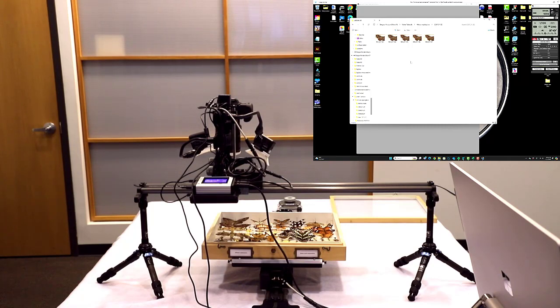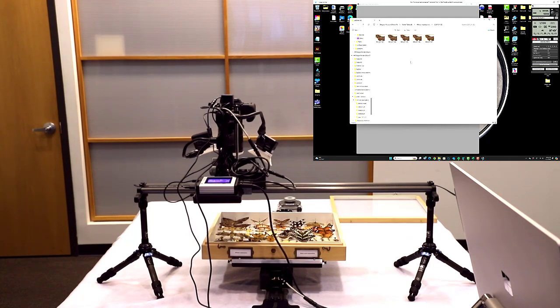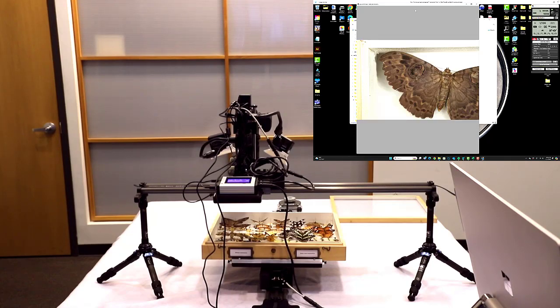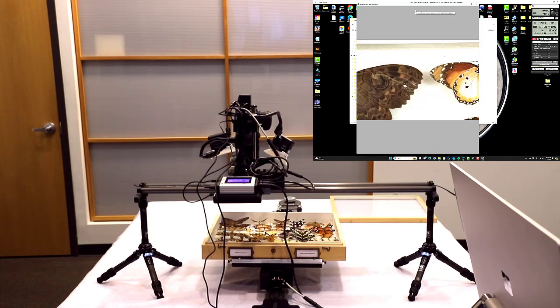So also stay tuned for a demonstrated video on how the other configuration is going to work. Again, I don't recommend that configuration, but it's there for you if you need it. So let's move forward with this. We'll just let the camera record this a little bit so you can kind of get a time-lapse video of what's happening. And I look forward to taking any questions that you might have of the system.